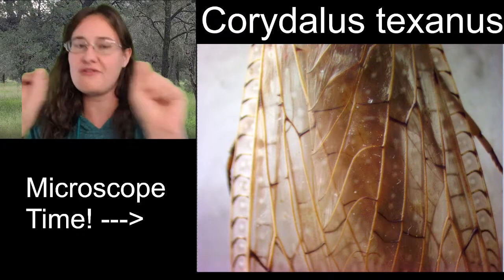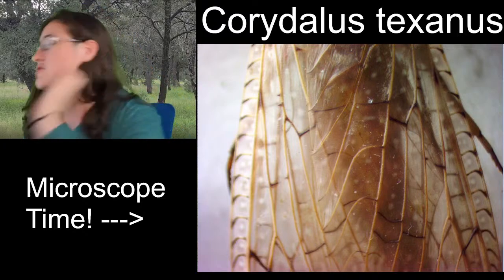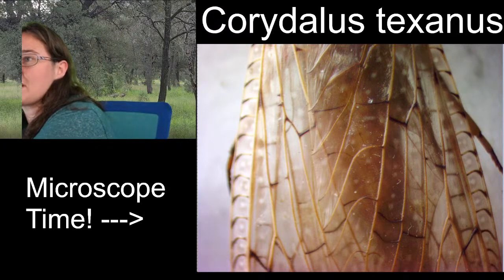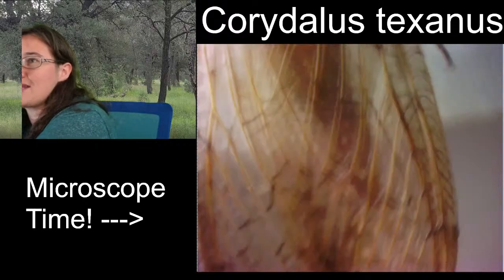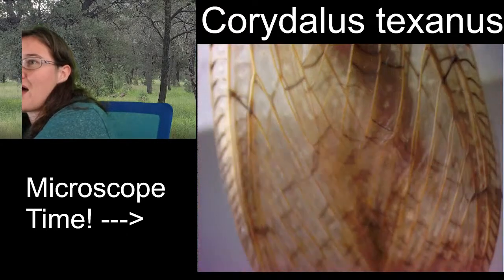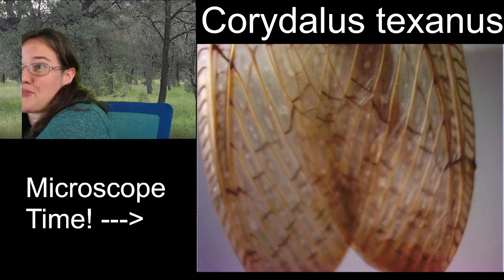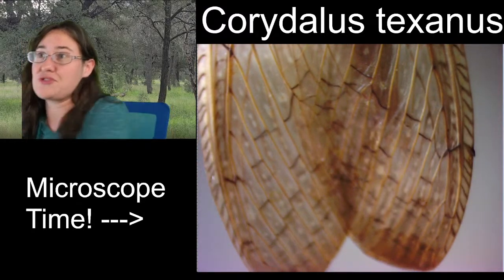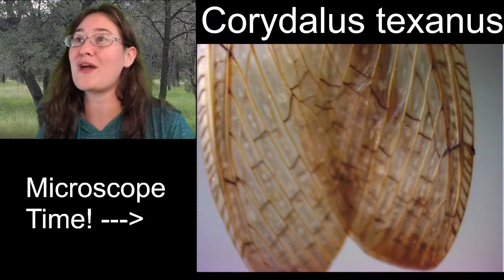You can see all of those individual square cells on the edges now because the wings have flattened out just a little bit. And then if we continue past, essentially, the wings take three, maybe even more than 3 microscope views to get through at its furthest away point.